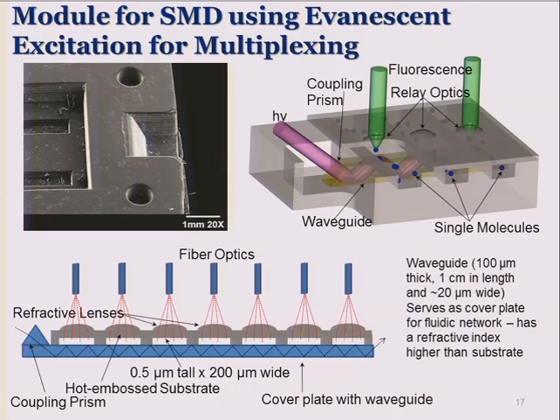So basically what we do is spatial multiplexing in this case. It minimizes some of the criteria on the hardware end of things. So we have an array of channels, each one corresponding to a different reaction that we're using to read out that result. All right, so spatial multiplexing, similar to an array, really.